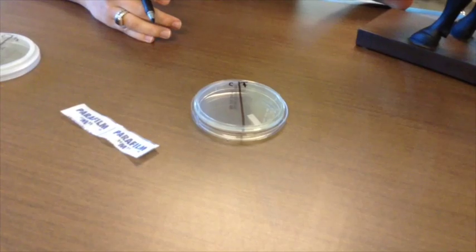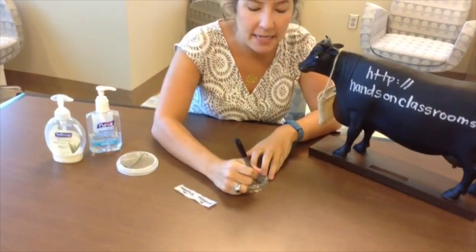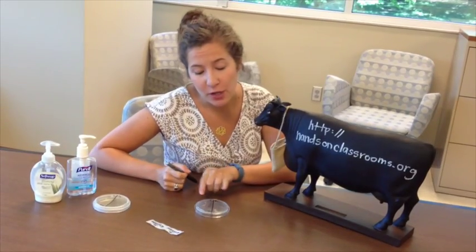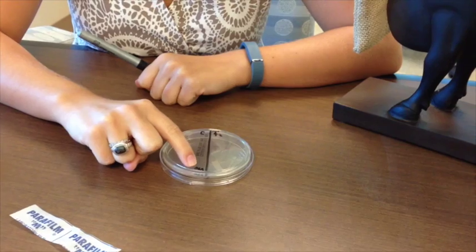Since I'm going to be performing treatment three, which is the hand sanitizer, I'm going to put a little three next to my T. After you have labeled both your treatment and your control side, make sure that you still put your initials in the bottom corner and keep them small so that you get your own plate back and not one of your classmates' plates.